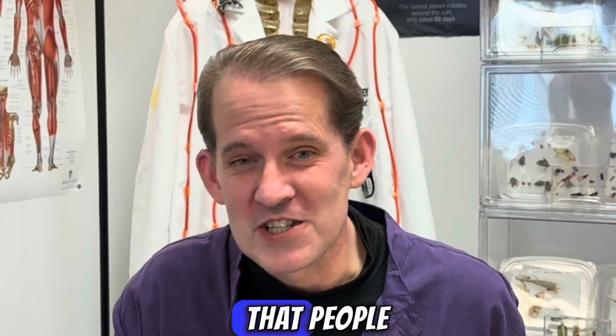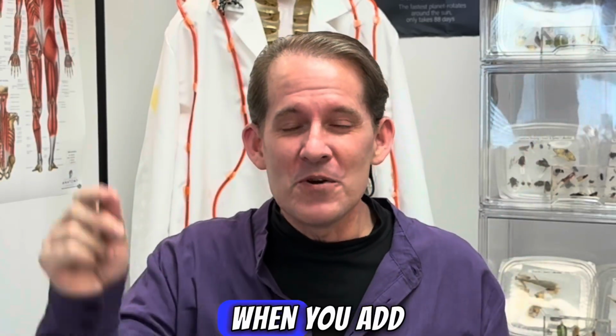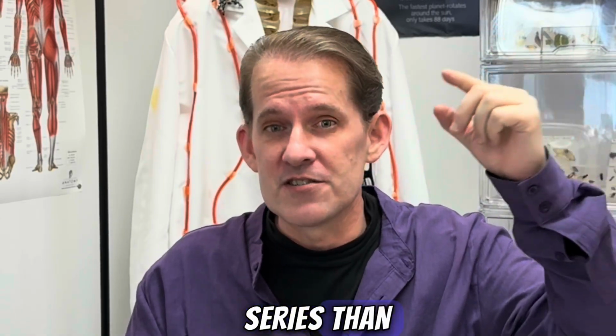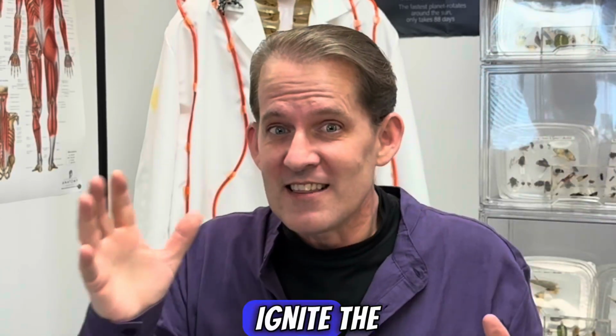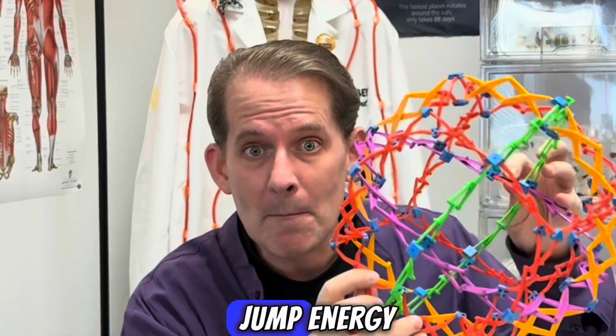So an important question that people often ask is, what creates that amazing blue flame? Well, when you add aluminum foil to the copper sulfate and acid solution, what happens is you displace copper ions because aluminum is higher on the activity series than copper. And when you ignite the hydrogen gas, those copper ions get excited and their electrons jump energy levels.